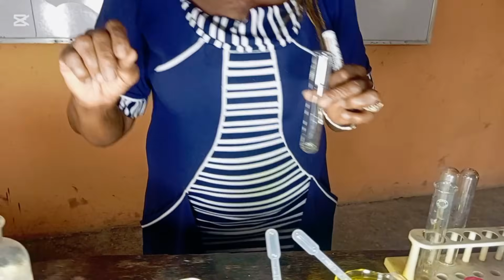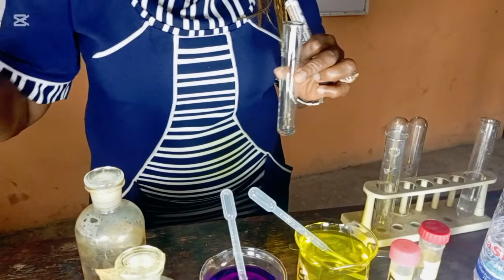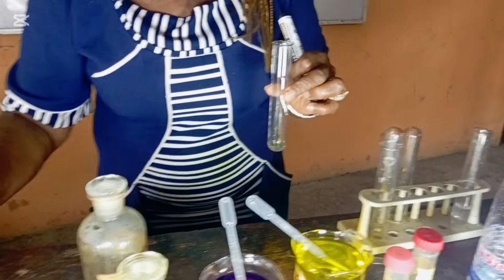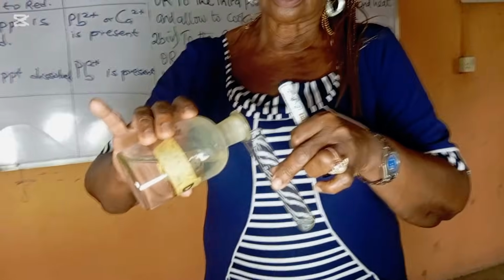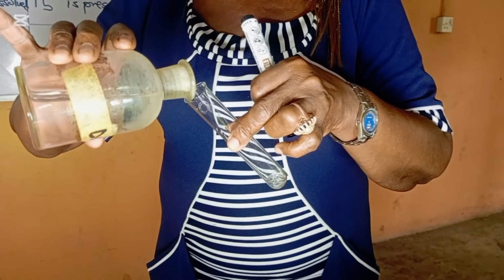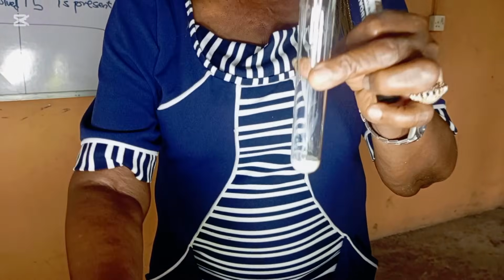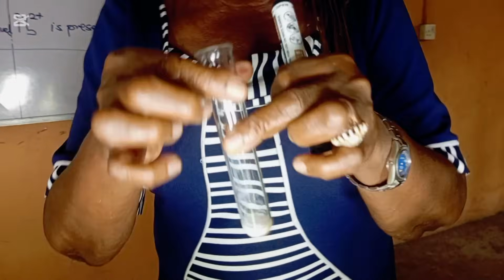This time I'm asked to use aqueous ammonia. And that's your aqueous ammonia. You cover every reagent after use. So you take your aqueous ammonia, you put it in what? In drops. Just in drops. You see? Exactly what happened with sodium hydroxide has happened again with aqueous ammonia.